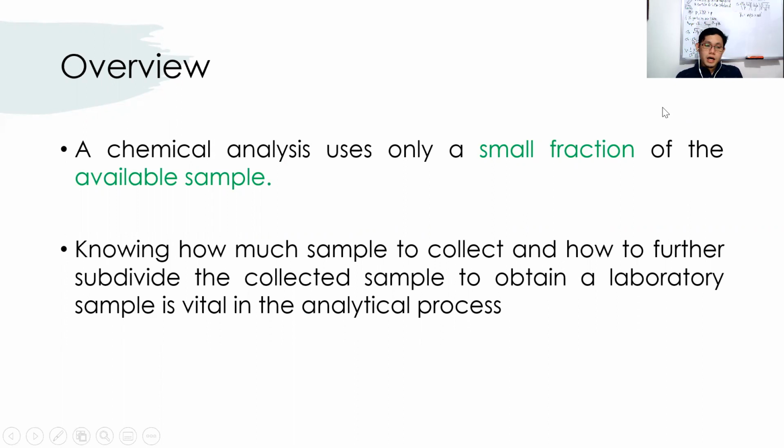And then, lastly, pagka small fraction na yung ginagamit mo ng available sample, it's possible na mas konti lang yung gagamitin mong reagents for that analysis. So, it's also a cost-saving process. So, pangalawa, knowing how much sample to collect and how to further subdivide the collected sample to obtain a laboratory sample is vital in the analytical process.